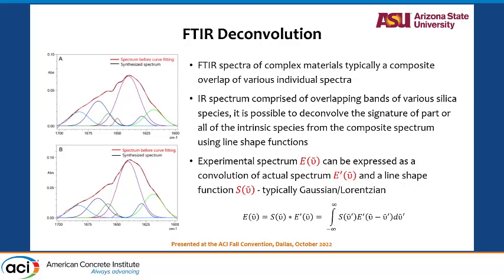So you need to deconvolute this, and the deconvolution is a problem. If you've done NMR spectroscopy, deconvolution for NMR is very simple, because the deconvolution of a Lorentzian shape with another Lorentzian shape gives you a Lorentzian shape. You don't have to do anything. But now, if you assume a line function to be Lorentzian, then you're doing a multiplication function here, because it becomes exponential after that. So then there are several different complications.